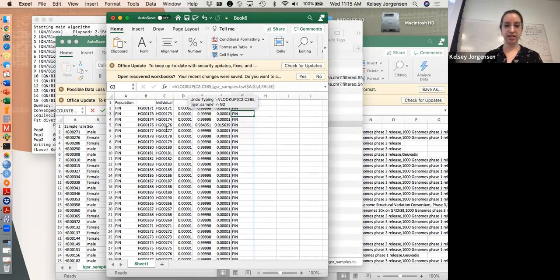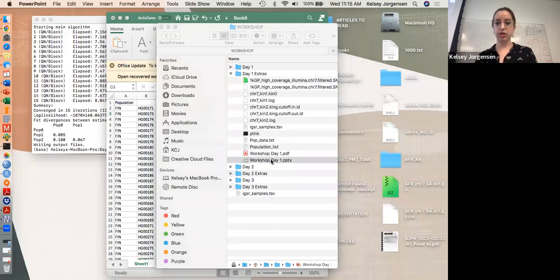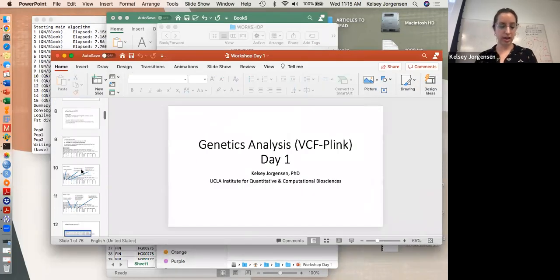Sorry. Yeah, so the reference file we pulled yesterday is from 1,000 Genomes. So I can show you where to get that.